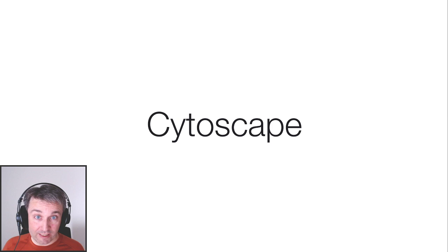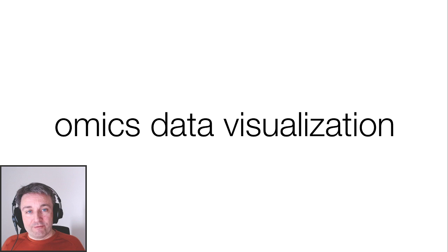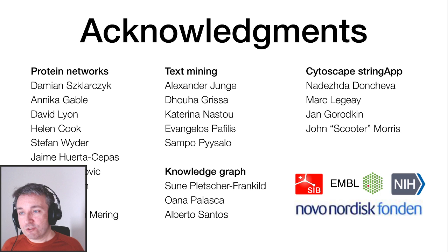It's a network tool. It has apps that you can plug in, like the String app, that is really useful for working with string networks inside Cytoscape. You have omics visualization. We can do a lot of things visualizing the data on string networks, both using the core functionality of Cytoscape and using omics visualizer.